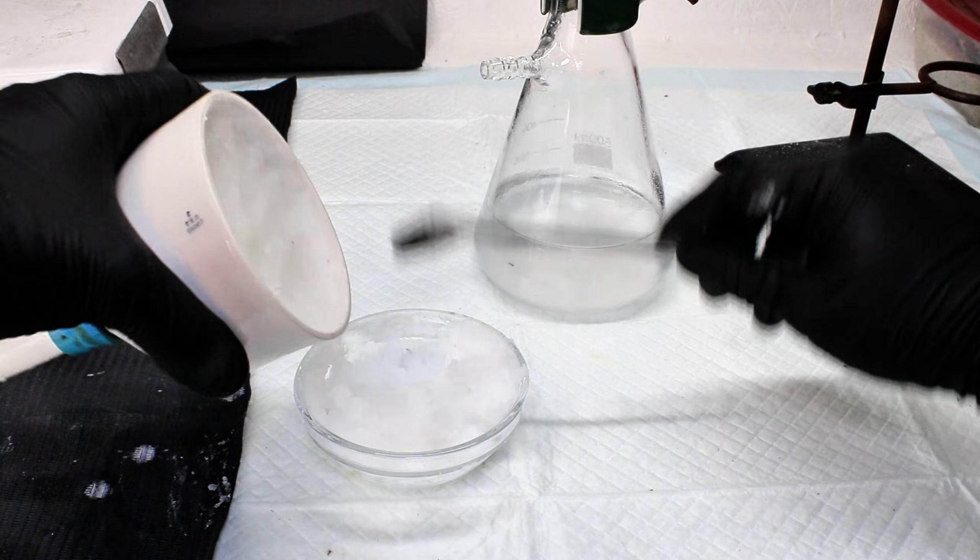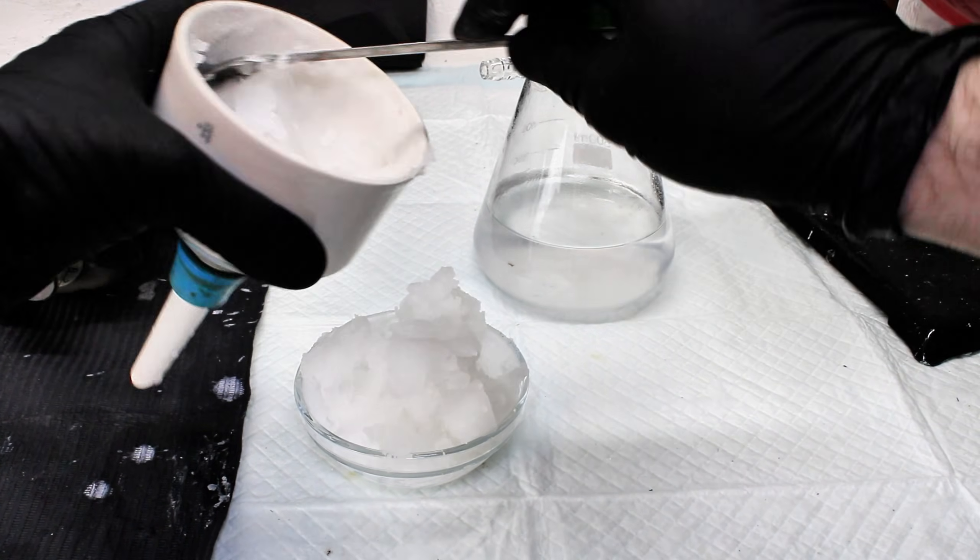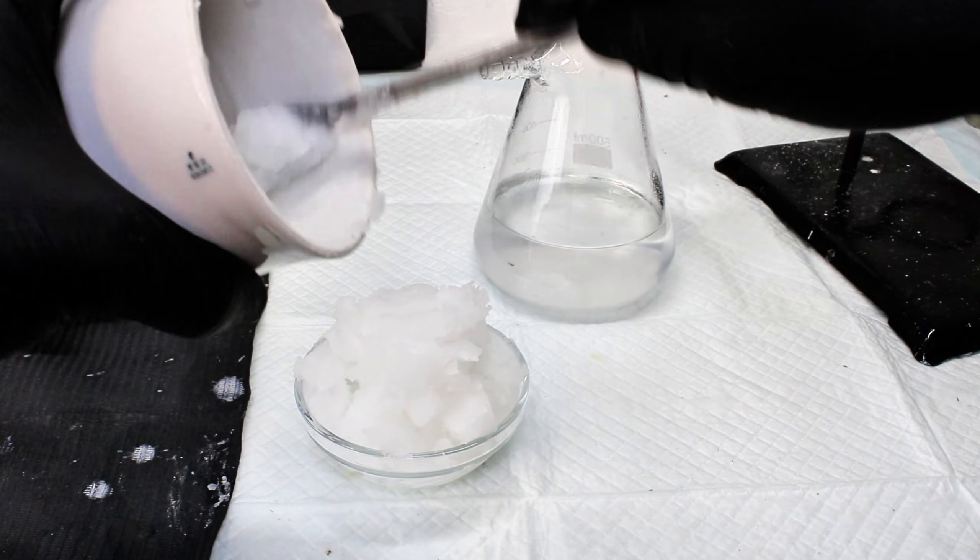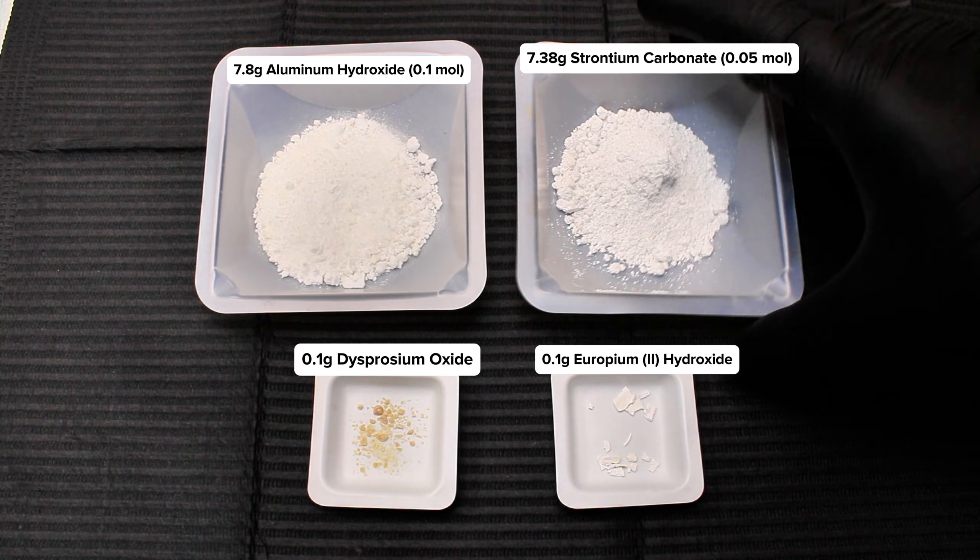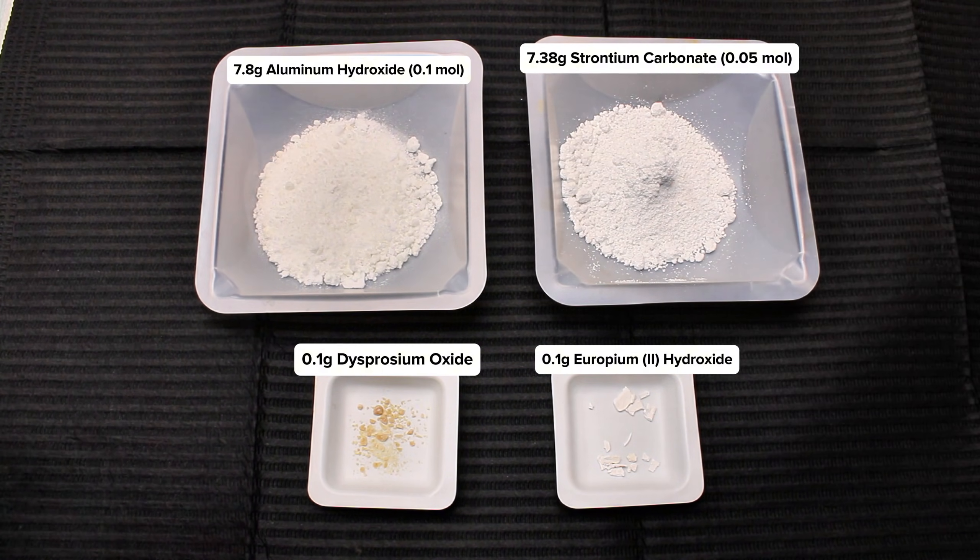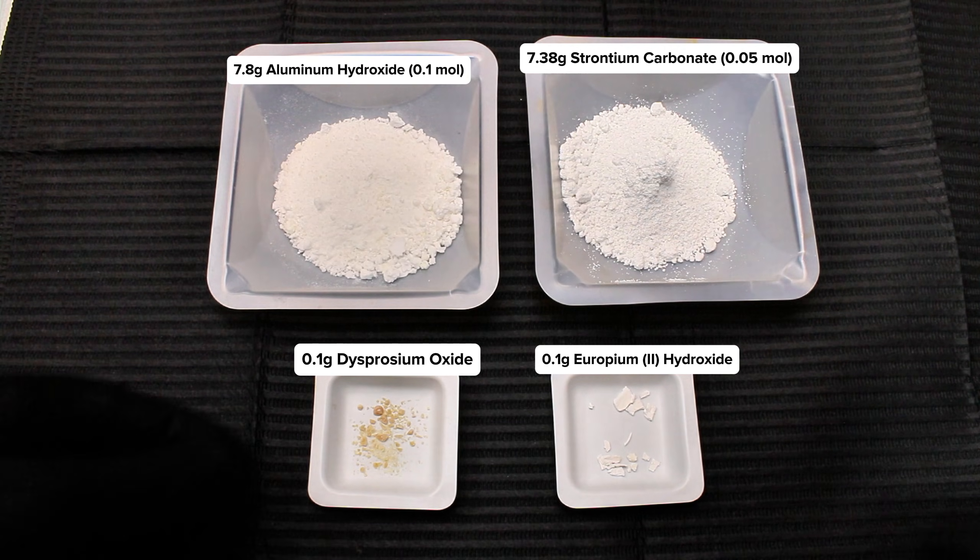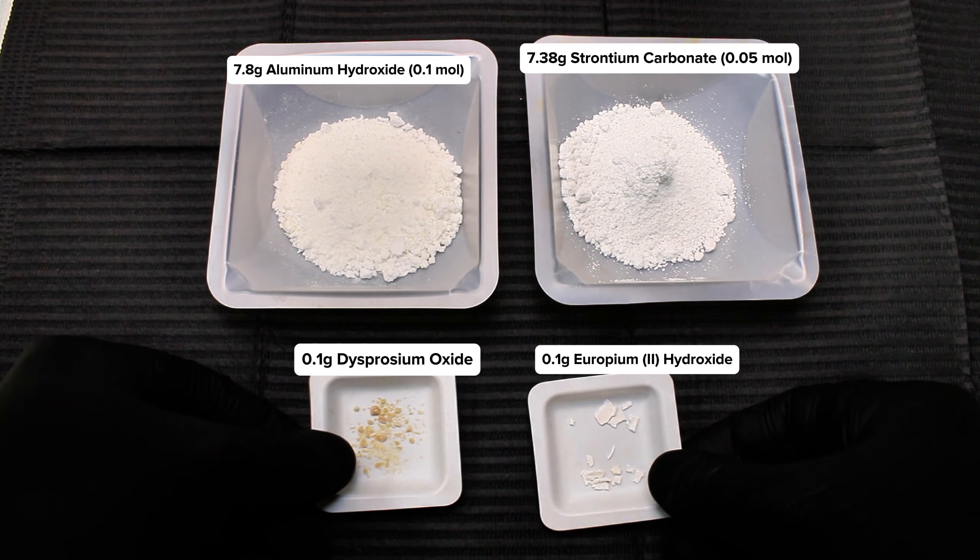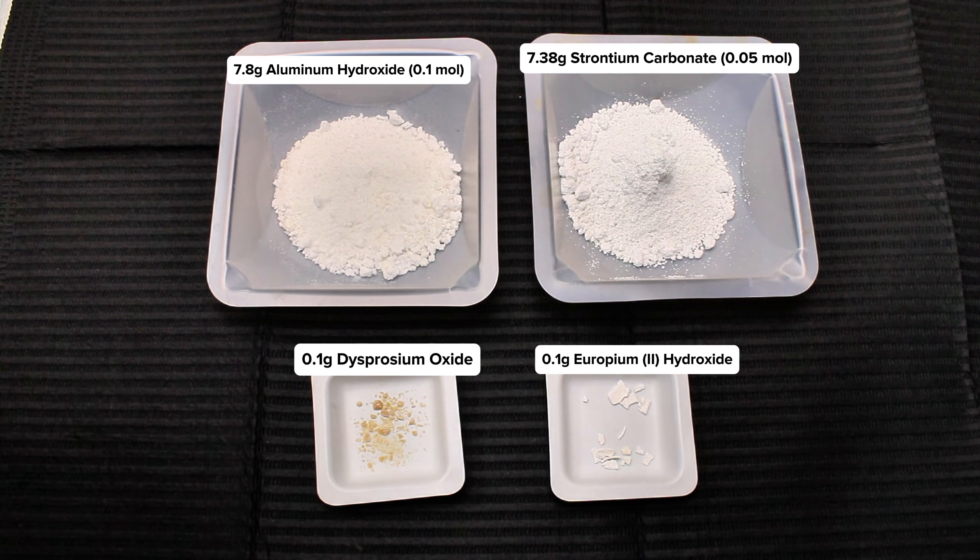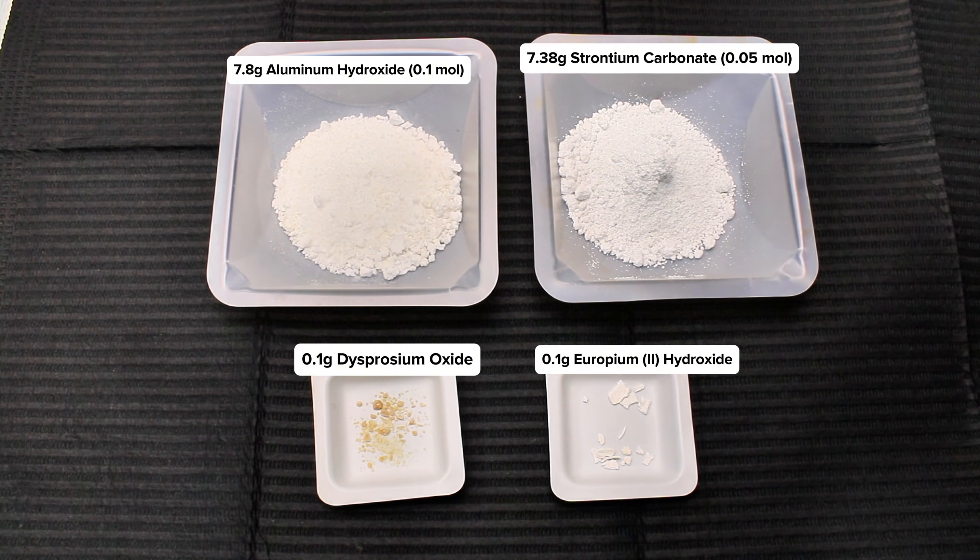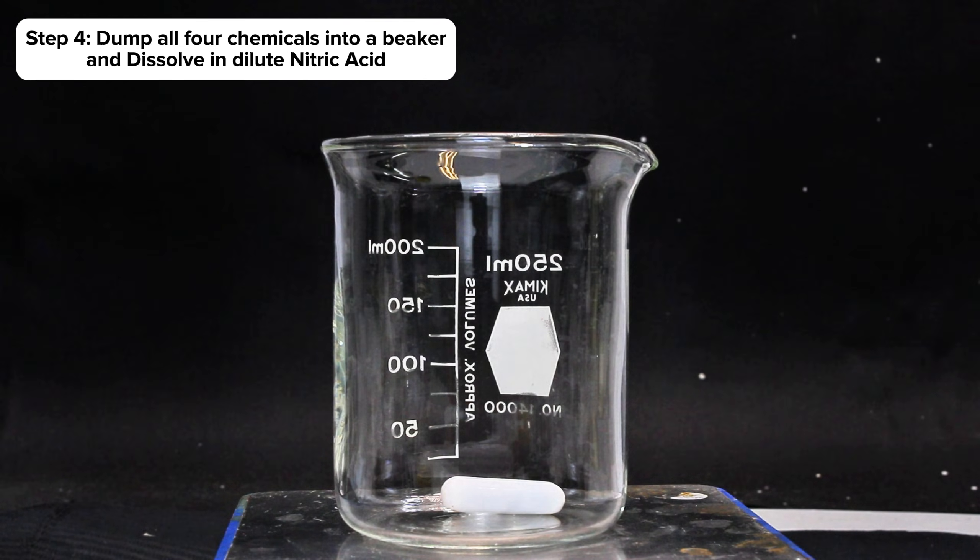This was next scooped into a dish and dried under vacuum desiccation for a few days. After it was completely dry, the aluminum hydroxide was powdered and 7.8 grams were weighed out. I then weighed out 7.38 grams of strontium carbonate, as well as 0.1 grams of dysprosium oxide and another 0.1 grams of europium hydroxide. These were all transferred to a new beaker along with some water, and to this I added nitric acid under constant stirring until no more bubbling occurred.